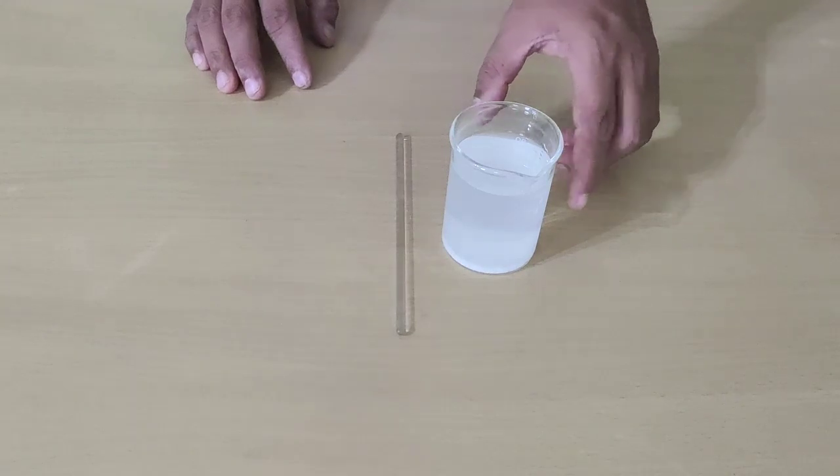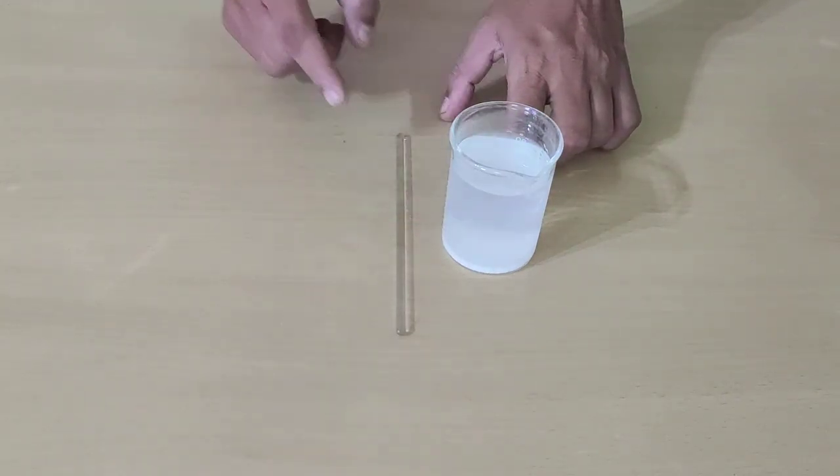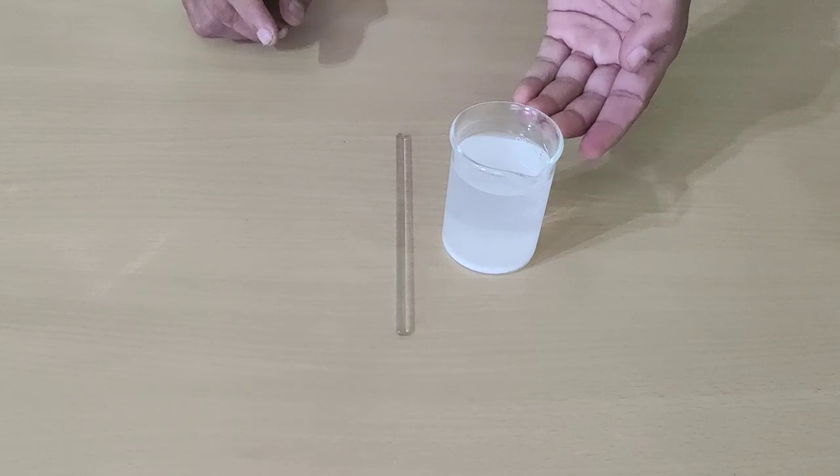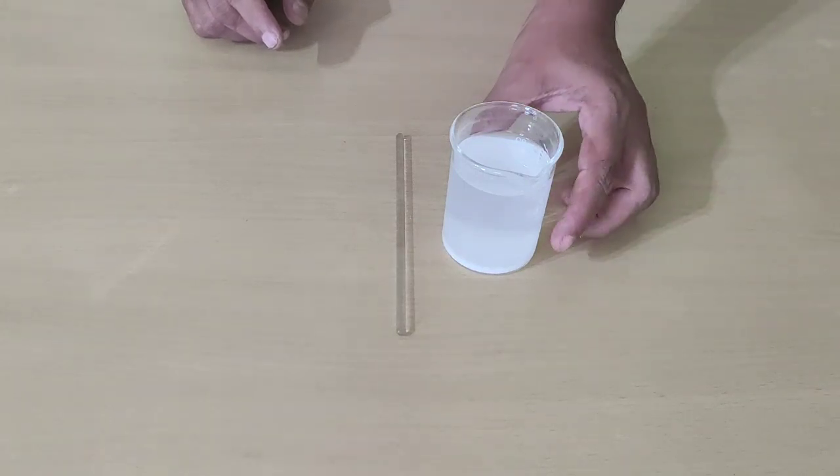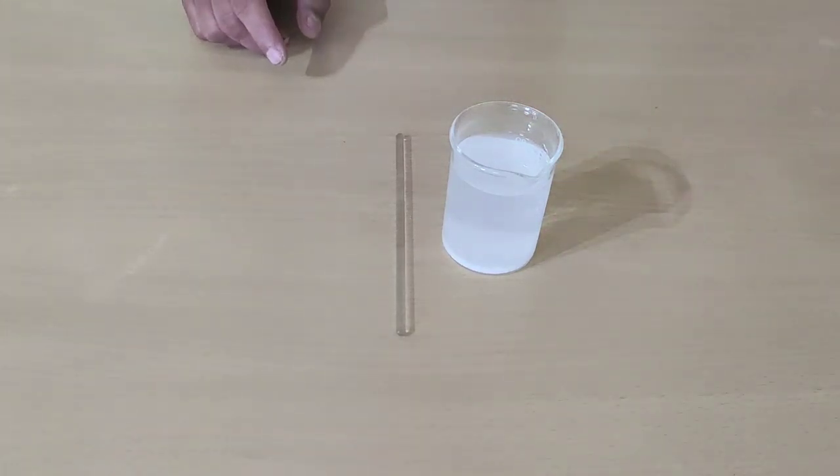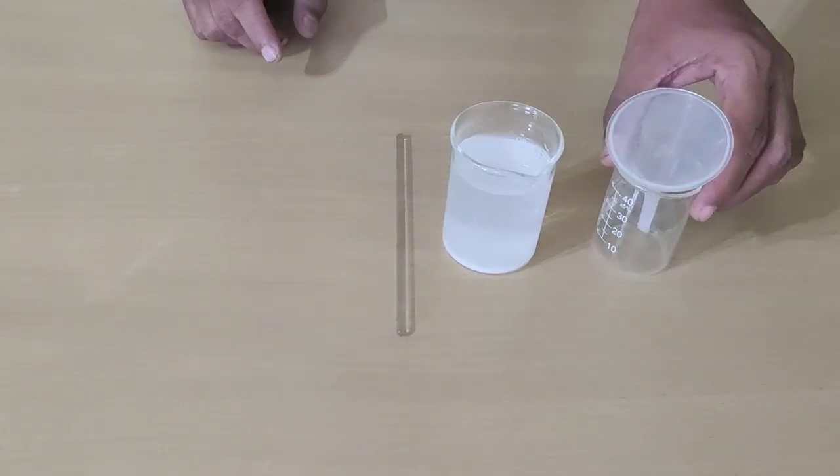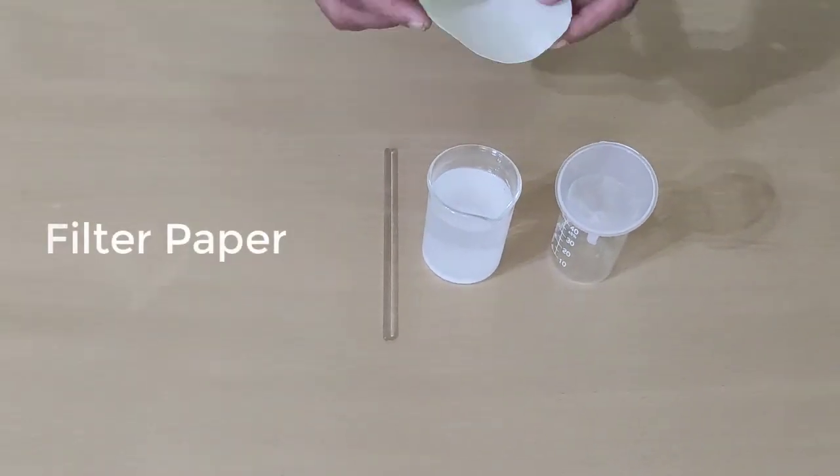Now we see the sediments of calcium hydroxide have settled down to the bottom of the beaker and the upper portion is still looking milky. So we will filter it in another beaker using a filter paper.